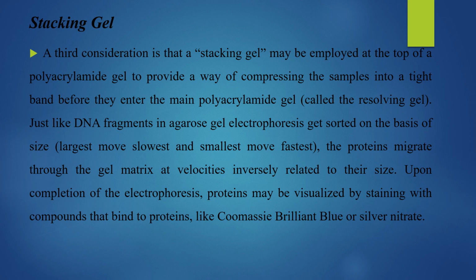Now a third consideration, that is stacking gel. A third consideration is that a stacking gel may be employed at the top of a polyacrylamide gel to provide a way of compressing the samples into a tight band before they enter the main polyacrylamide gel. So you are finding a way of packing your content before you introduce them to the separating gel.